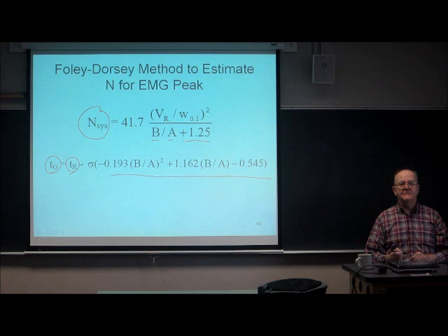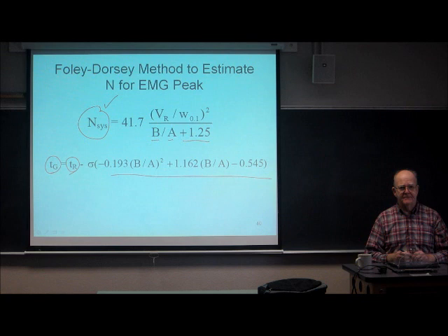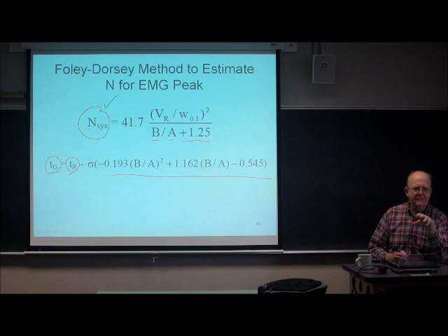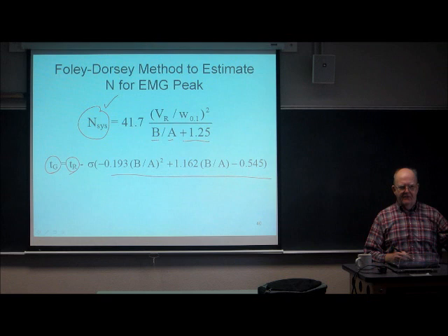This second one is not very important. This is the one that we use a lot to get a decent plate count when we've got a tailed peak. Now, most of the chromatographic data systems on this planet assume that the peak is Gaussian. Doesn't matter if your eyeball is telling you that's not Gaussian. It assumes it's Gaussian unless you override some of the algorithms in it.